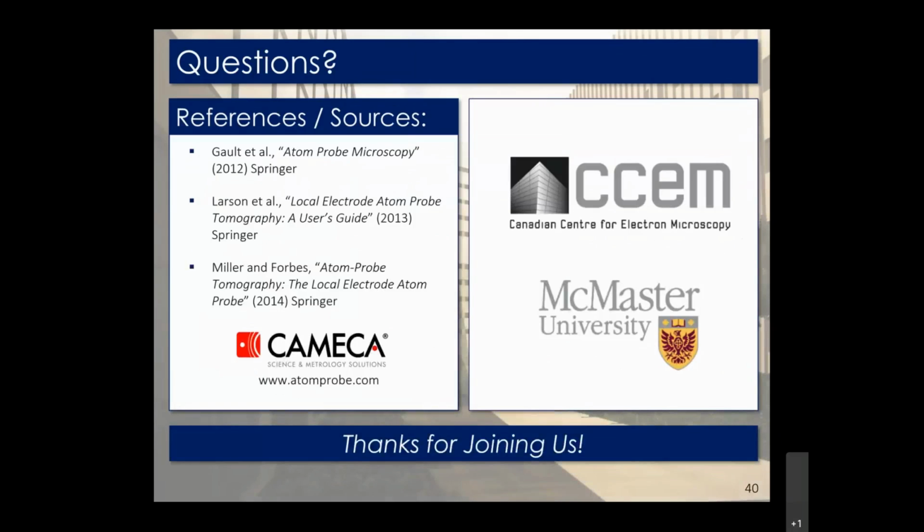So with that, I'd like to conclude the talk, and sorry for rushing in the beginning too much. I'm just really excited about Atom Probe, I guess.